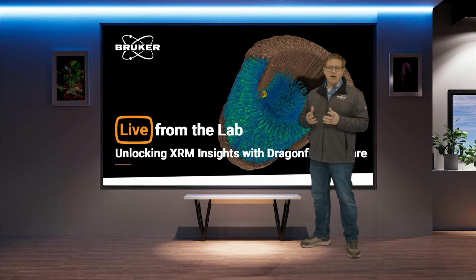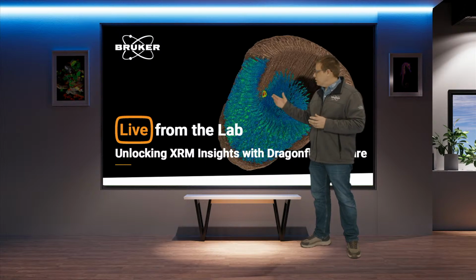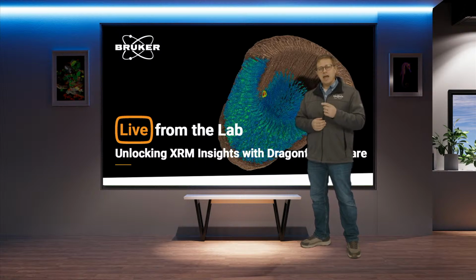Bruker, of course, does offer some world-class software in this area, but some people prefer other workflows. And one of those workflows can be found in Dragonfly. So today, we're going to go through a get-you-started type approach to this. We're going to see that software in action and then answer any questions that you happen to have about it. So with that, let's head on over to the table and let's get started.